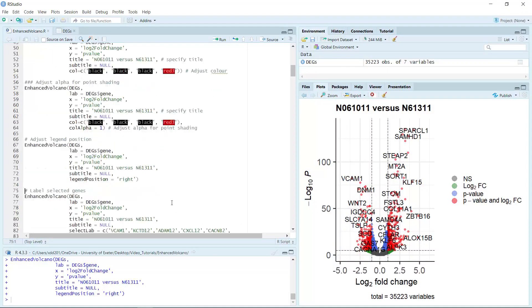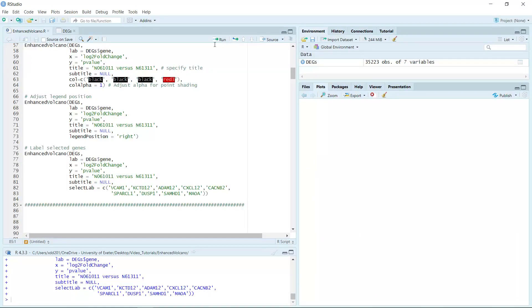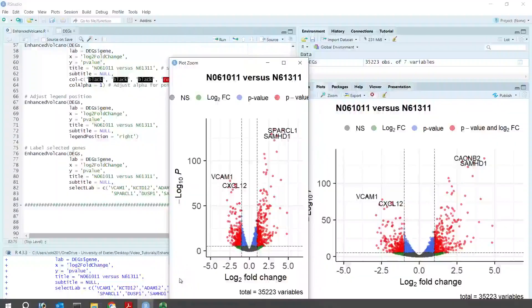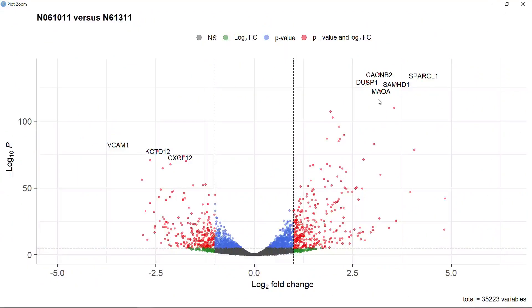For the last demonstration, I'm going to show you how to label selected genes. We need to use the selectLab argument. Here we select nine genes to label their positions on the volcano plot. After running, you can see the plot is generated. Because the plot window is quite small, you may only see four genes, but if we zoom in and make the plot bigger, you will see all nine selected genes labeled on the volcano plot.